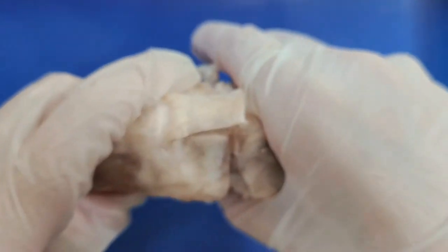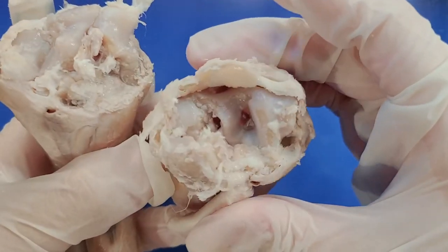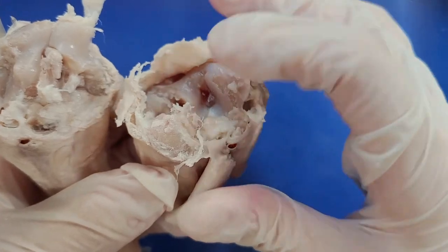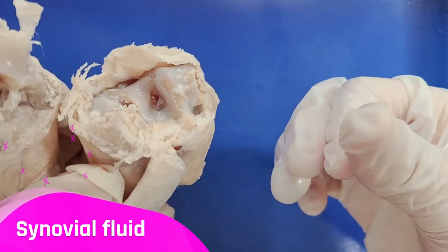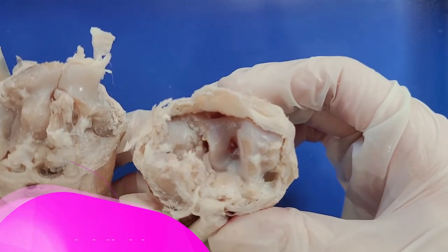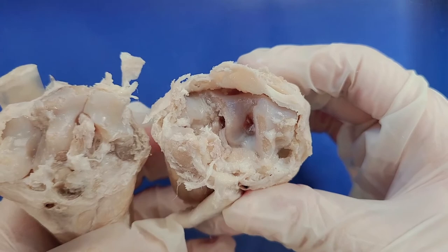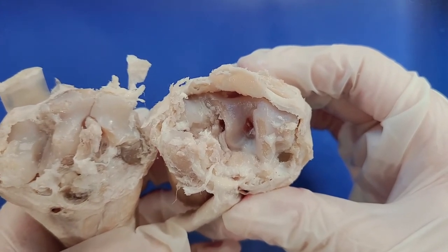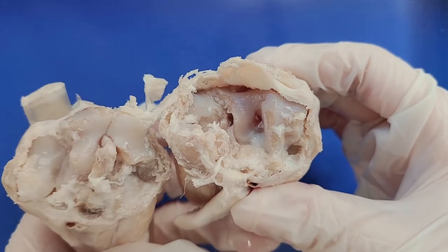Here you might see some liquid that was inside the cavity of the knee joint, and this is called synovial fluid. It's a thick liquid that lubricates your joints and keeps them moving smoothly. The synovial fluid also provides nutrition to the cartilage on either end of the bones of the joint.